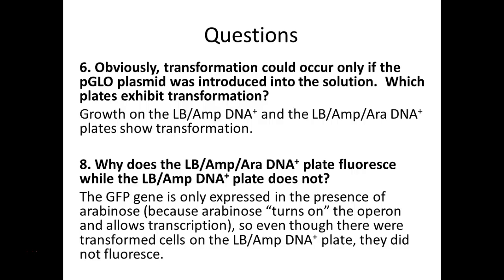Yes, because what would happen to them if they weren't transformed? They die, because the ampicillin selects for transformants, right? Having that ampicillin, only the ones that took up the DNA and utilized it, at least for the ampicillin resistance, will grow in the presence of ampicillin.